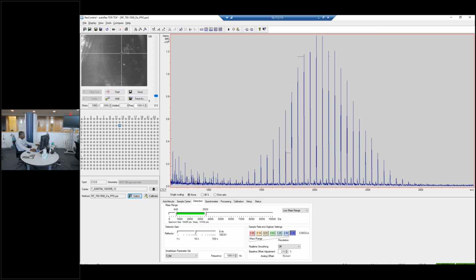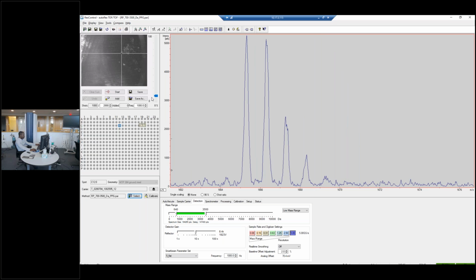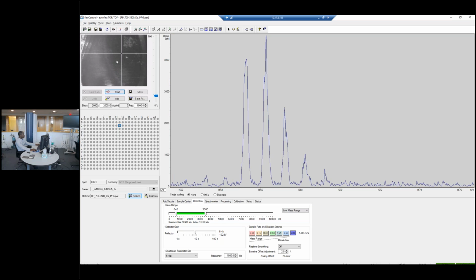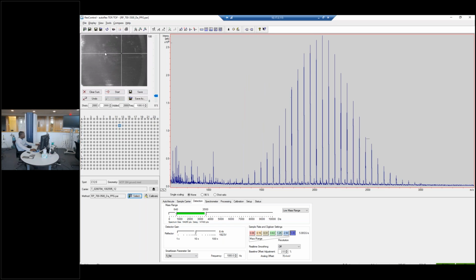As you can see here, we had a kind of a shift in molecular weight. So the first one was 1500 Dalton. Second one is 2000 Dalton. And I'll zoom in again just for better visualization to make sure that the method I'm using is optimized. And this is good enough resolution. I'm happy with this. So I'll go ahead and collect a few more spectra and average them.